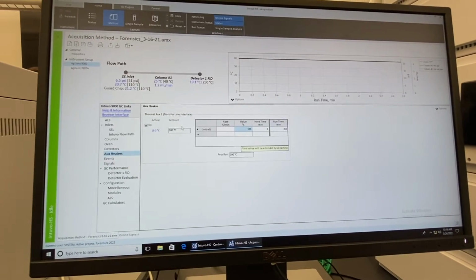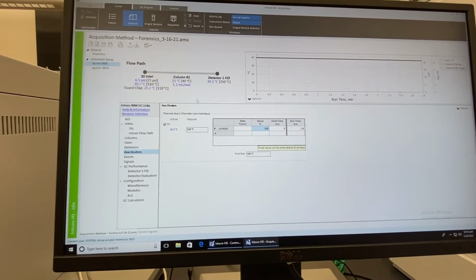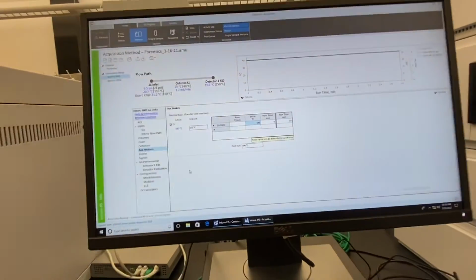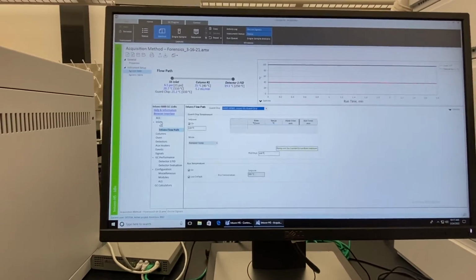Okay, and you wanna note this information in your lab reports. So you're gonna get the information from this video. I don't want you to do it when it's your time to run, just so we can save time and have everyone run in a timely manner. Okay, so right, let's go over the inlet.